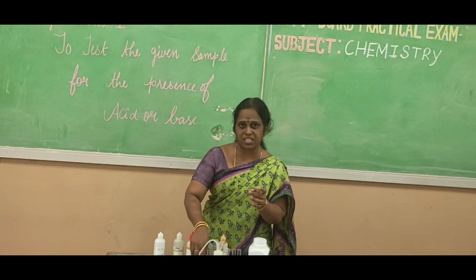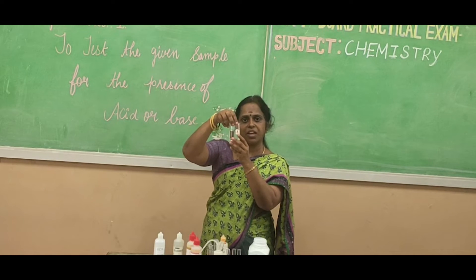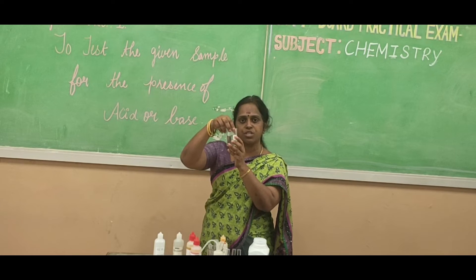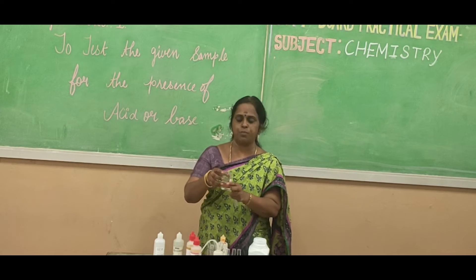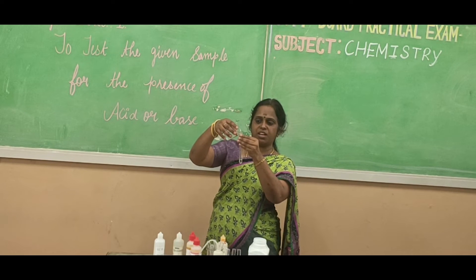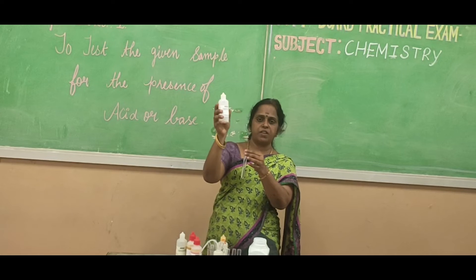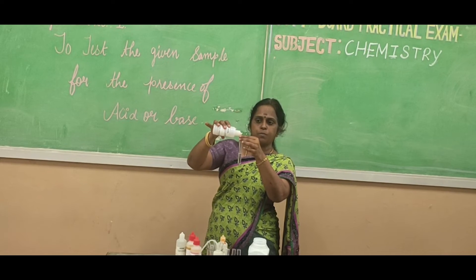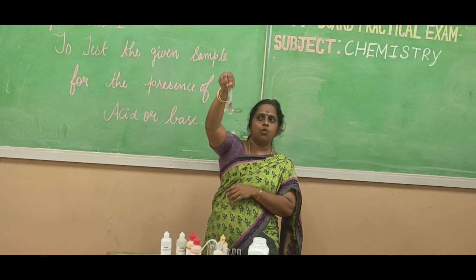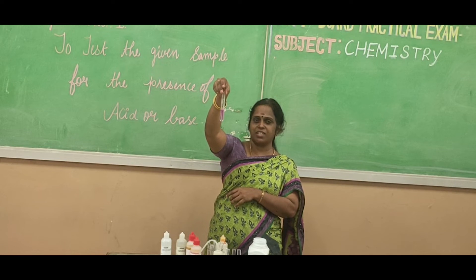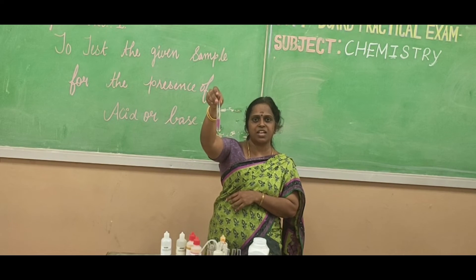Now I am going to test the next solution, labeled as A. In a similar way, I will use the three indicators to test whether this given solution is a base or an acid. I take a test tube and add 5 ml of the given solution. I add the first indicator — phenolphthalein. A few drops of phenolphthalein are added. What do you observe? You observe the solution turns pink in color. This confirms the presence of base — the given solution is a base.